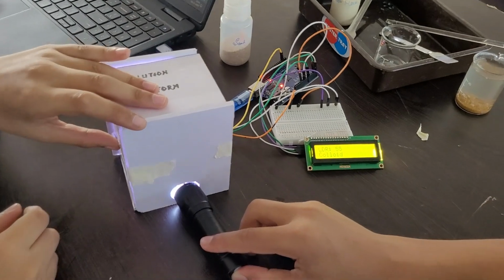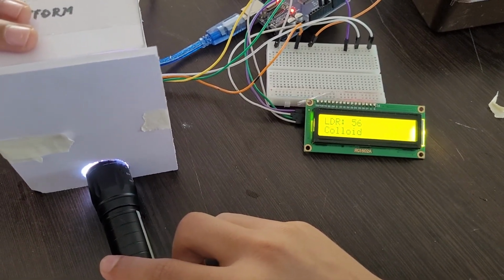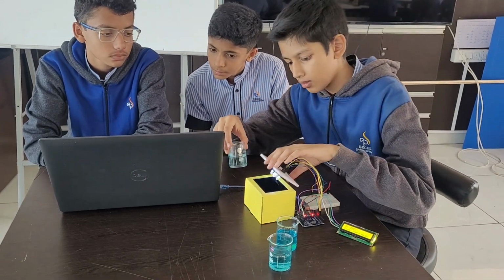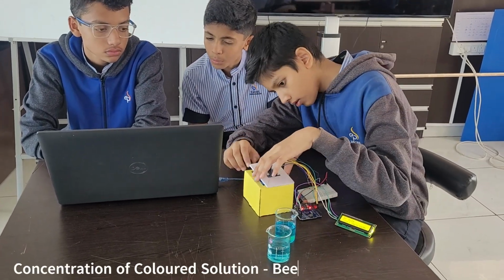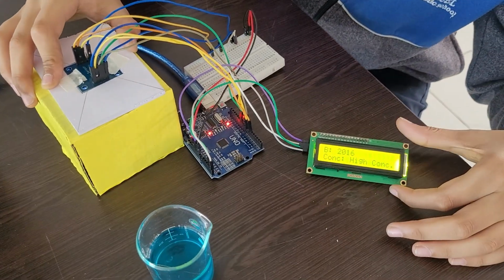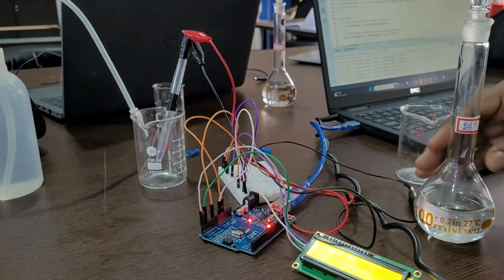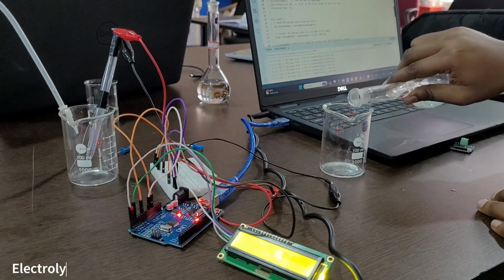Electrolytes and non-electrolytes. This experiment uses a DIY conductivity probe to measure the ability of different substances to conduct electricity. By testing electrolytes like hydrochloric acid and sodium hydroxide compared to non-electrolytes like distilled water, students will observe that electrolytes conduct electricity while non-electrolytes do not.